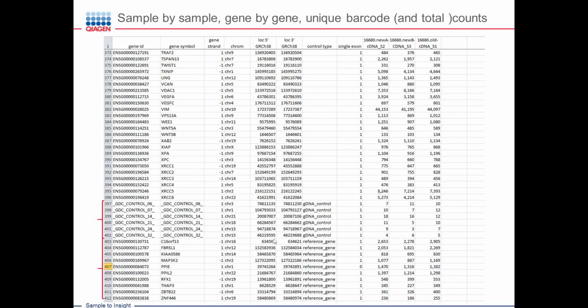We do include a bunch of reference genes, which we have in there because over all of our experiments, and from databases, they're expressed at reasonably moderate levels and a fairly wide range of expression. You're free to use those as reference genes. You're free to pick among them. You're free to pick any genes in your panel that you want, or none of them. If it's a diverse panel, we typically use total number of tags as a normalizer. If it's a targeted panel where all the genes are differentially expressed, you probably don't want to do that. You probably want to use a reference gene, and you can add whatever you want to a panel.